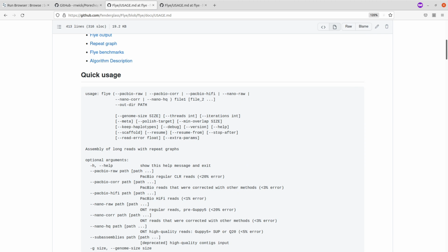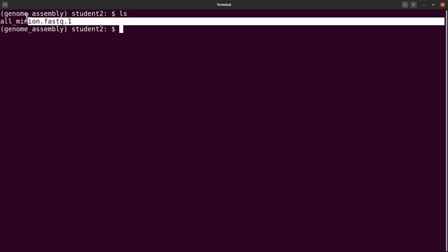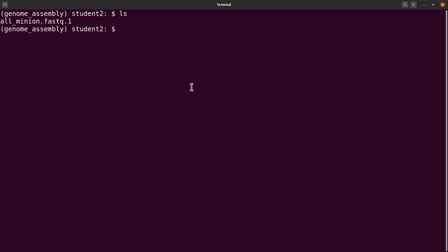So now back to what we want to do. We are going to first trim. Okay, so let's do an ls to get our data. This is our data. So we are going to trim it. You can also decide to rename it just to make it fine, but for now let's just stick to these ones here.